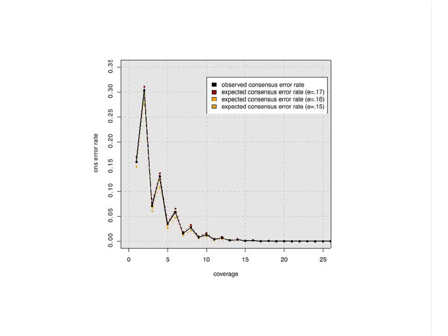It depends, again, on what Sergey just said, what you're looking for. If you're looking for SNPs in human resequencing, I think far and away the better option is to just do Illumina or Complete Genomics or SOLiD or whatever your short read preference is, because those do a very good job of pulling out the exonic SNPs and things that you care about. With the reference genome, it's probably not necessary to use a long read technology because you already have the structural information.